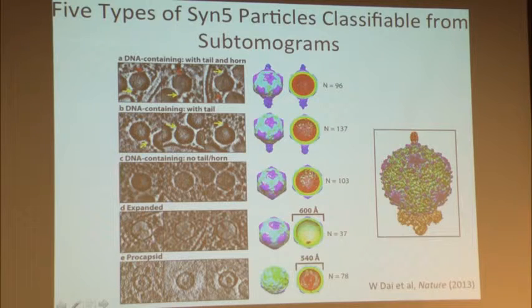We were not able to purify any of those others for quantitative studies. So that signifies the future of structural biology. Maybe we turn into the cell. Forget about doing biochemistry. Just look in the cell, improve the imaging technology, improve your computing power to get the structures of this intermediate, transient or short-lived assembly process. And another interesting thing is we see this particle has only the tail without the horn. That immediately suggests the horn is the last part to be assembled.